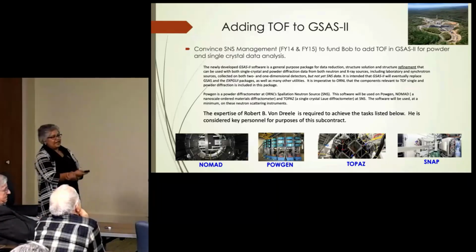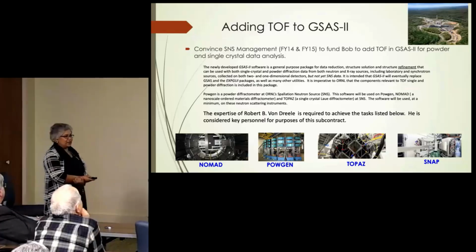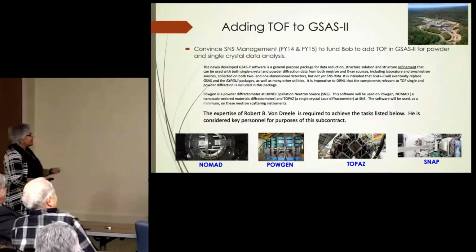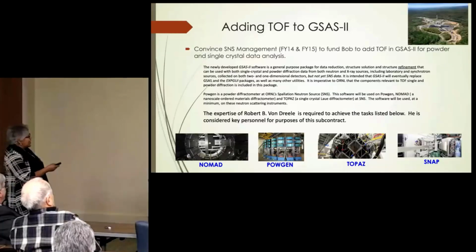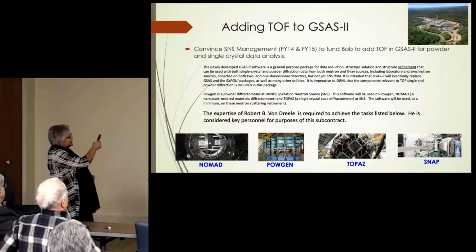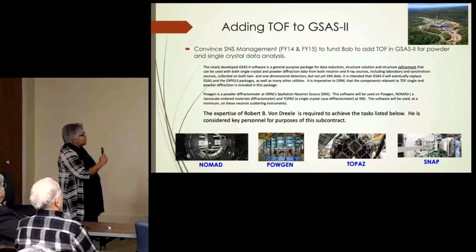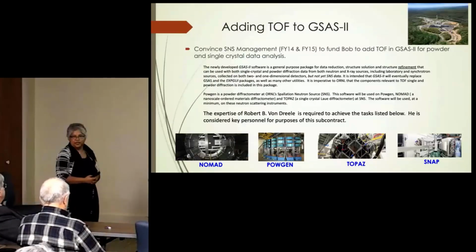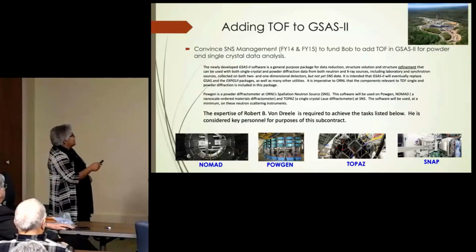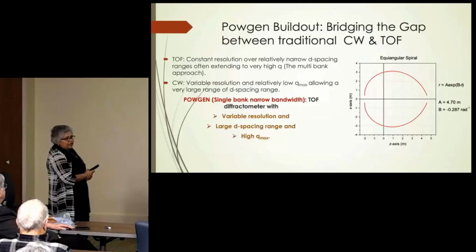You came in and visited a couple of times to help me convince my management. So yes, this was actually said, and this is the document where I essentially highlighted the expertise of Bob Von Dreele is required to achieve the task listed below. So that's what it took for us to get GSAS-II and time of flight playing together.